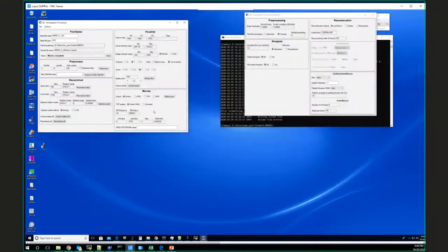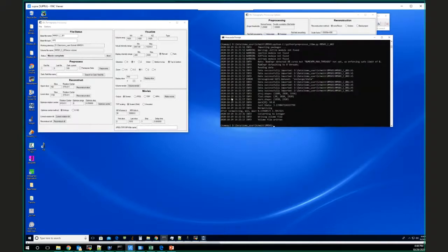Okay, so I think you get the gist of it here. What we would now need to do is, there's another data set that needs to be pre-processed and two more that need to be reconstructed. Once those are all reconstructed, we can stitch them together, taking into account the overlap between the data sets, the 300 microns or so, into a giant recon volume that would be almost 16 millimeters tall, and 11 by 11 millimeters in X and Y with quite a few voxels of data.